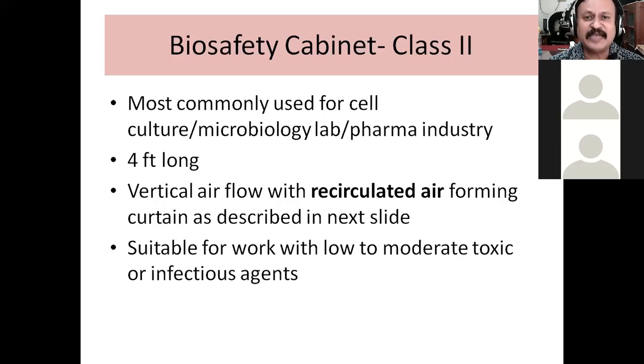Probably one reason which I am going to tell you, you may like it or you may not like, okay? But one reason for recirculating the air is that since that air was already filtered, it has come through the pre-filter, and then it has gone through the HEPA filter, and then it is going into the cabinet. If you compare that air with the other air which is outside, the ambient atmosphere, then probably one thing is clear, that this air is relatively much cleaner.